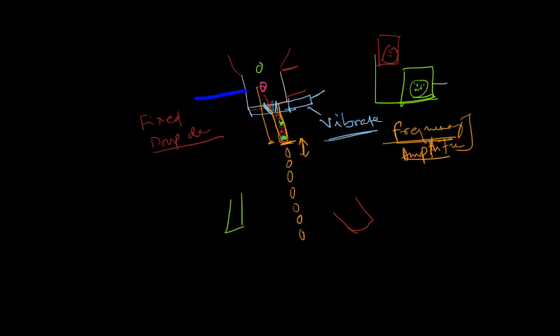Here I give a command to the instrument: sort, for example, gate 1 to left, and sort gate 2 to right. We have the drop breakup point, stabilized and fixed, and now we know the drop delay. When we give this sort command, the moment the instrument detects a cell falling into a desired region, it waits for the cell to travel to the edge of the stream.